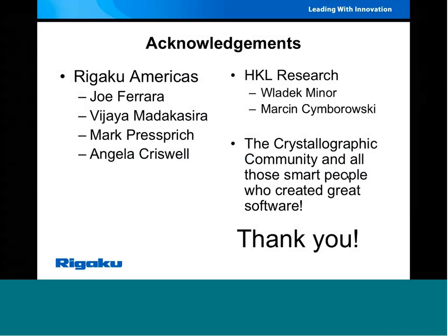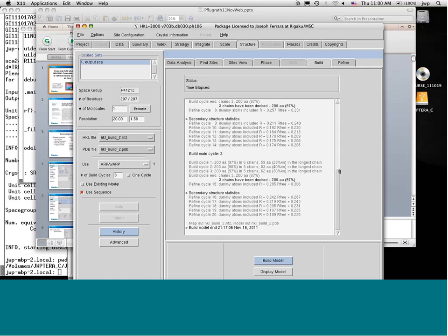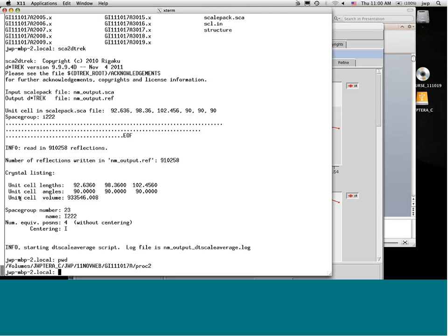Okay, great. That's fabulous. Thanks, Jim. So if you have a question, then go ahead and type those in. I have a couple of questions already, but I wanted to go back to one thing, a question for me that I don't know if some of you caught. I'm wondering about the SCA to DTREC. So do you need a special version of D*Star Trek for that? Which versions have that in there if they wanted to use it?